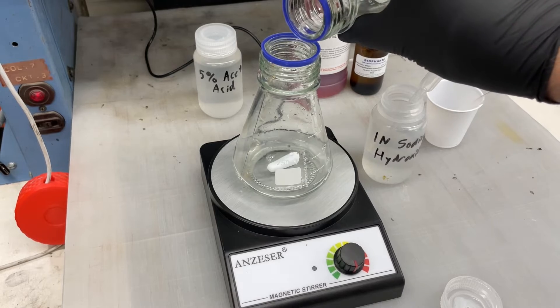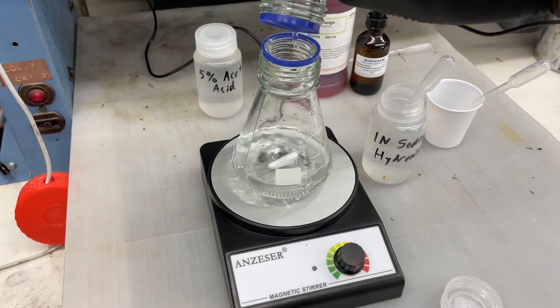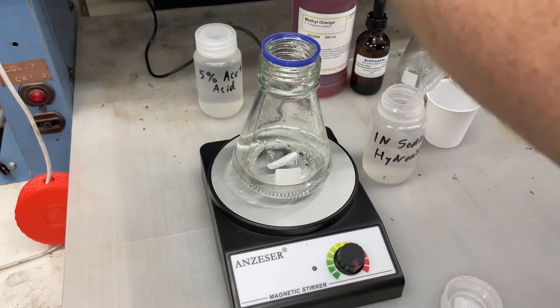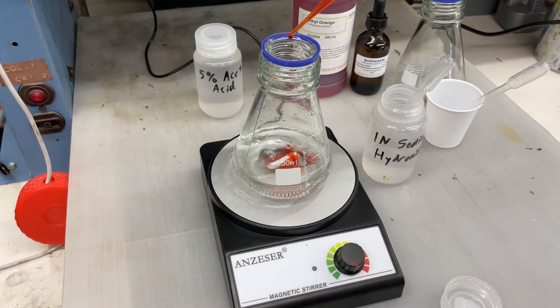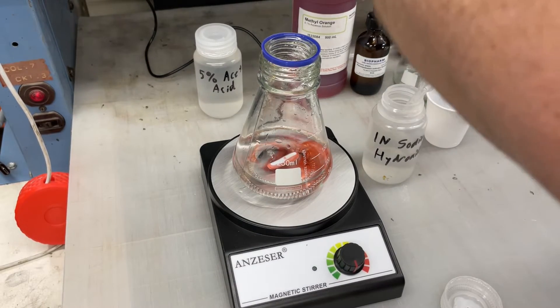So in my 250 milliliter Erlenmeyer flask, I have a 5 mil sample of my electrolyte solution, and I'm adding 50 milliliters of DI water. The instructions say to do two drops of methyl orange, but I've found that four is much easier to see.